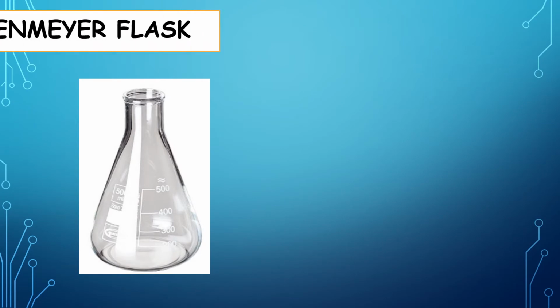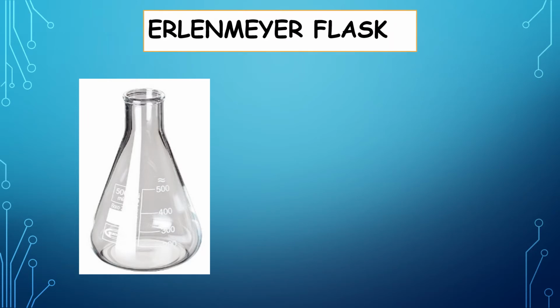Let's move on. So what about this one? What is the name of this picture? It is called Erlenmeyer flask. Okay, Erlenmeyer flask. What is the function? It is used for heating.